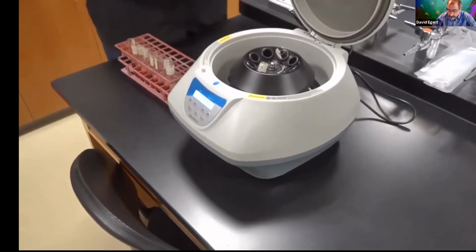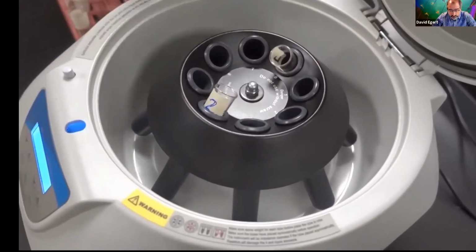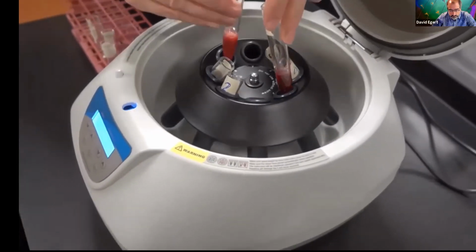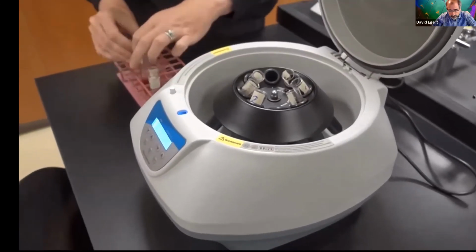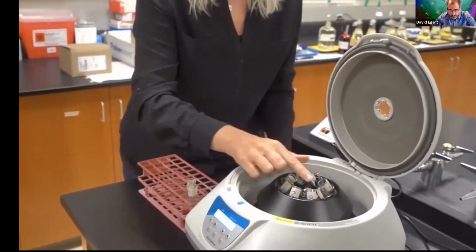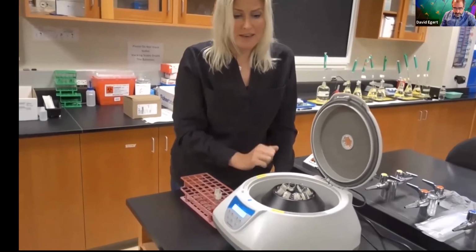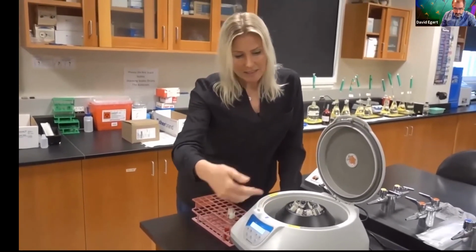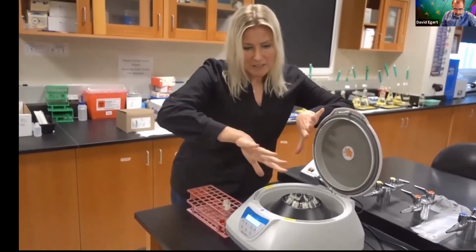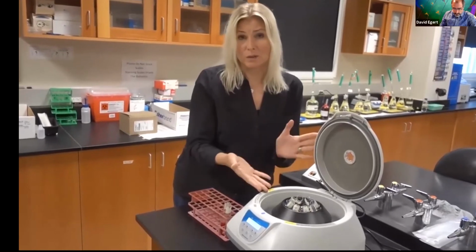If I were to only do 2 tubes, this would be balanced. But then I just keep adding tubes across from each other. As long as they are the same volume, they have the same weight, and everything should be fine. I do not need to cover the test tubes with any parafilm, because you can see that they're slanted, angled out, and the centrifugal force moves everything out and downward. So there should not be any risk of anything spilling over.